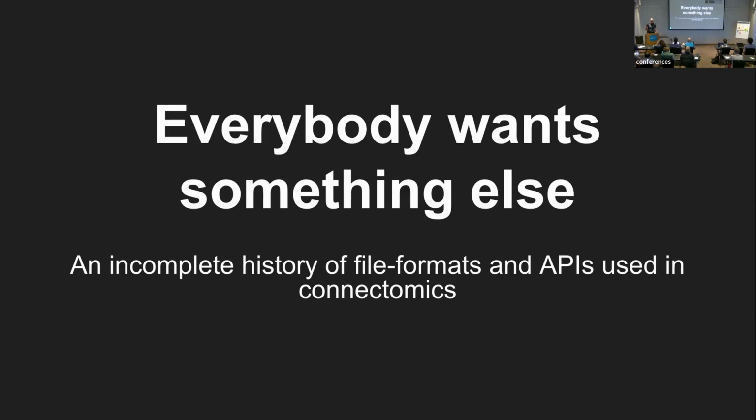So what is connectomics? There are a couple of different opinions. There's an older school opinion: working with MRI and stuff like this, they talk about how brain regions are connected with each other. What I want to talk about here is the real stuff. Getting such high resolution data that you can actually see every individual neuron, every synapse, that people are trying to recover from these data sets, wiring diagrams. So how does this look in practice?